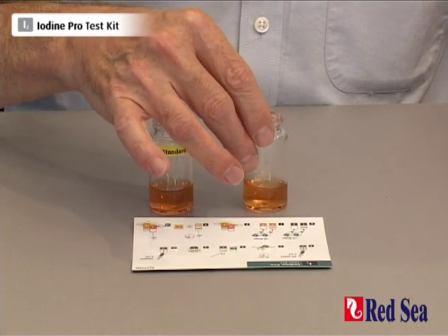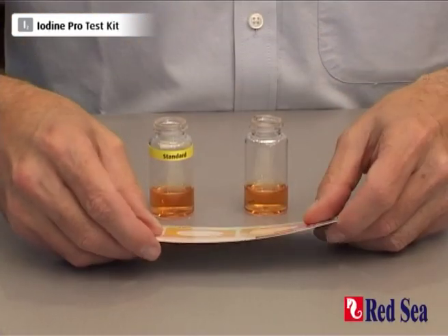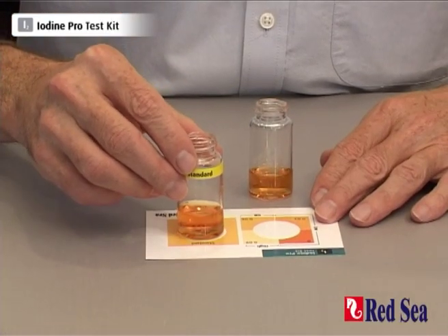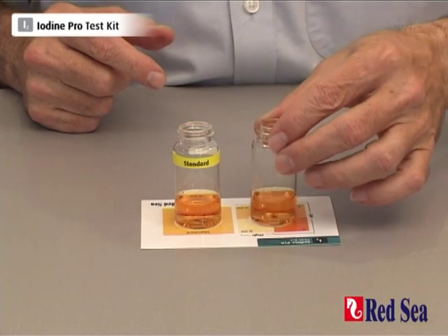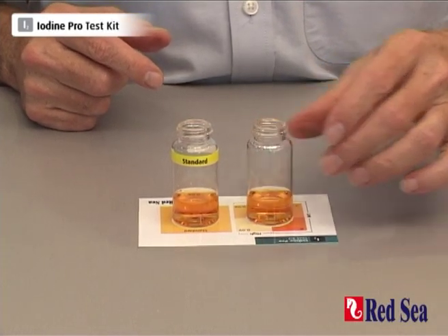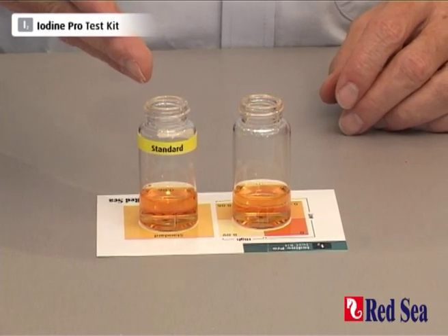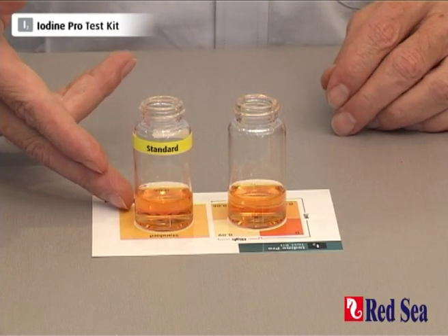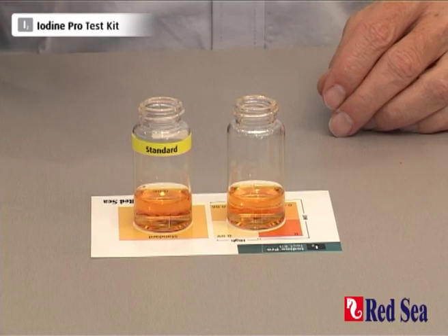Now in this test the standard solution acts as a timer. We're going to place the standard vial on the card where it's marked standard, and the test vial in the position on the card. We look from above and wait until the color in the standard vial matches the standard color, and at that point we can read off the exact level of iodine we have in the aquarium.